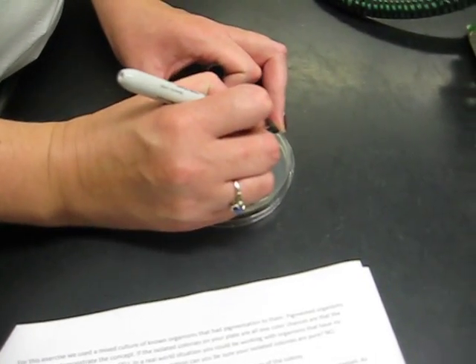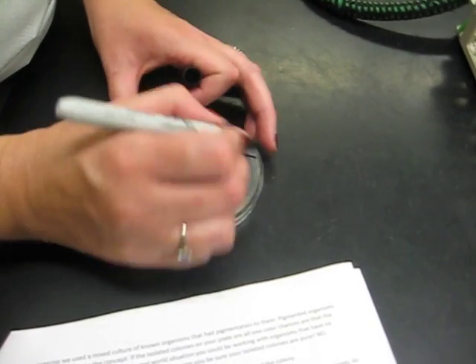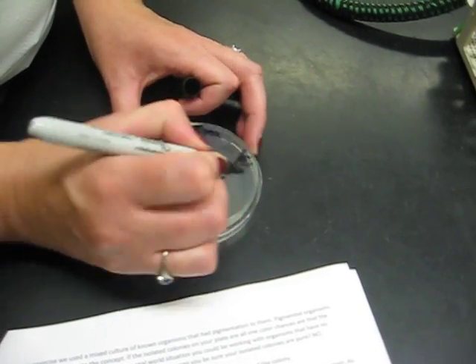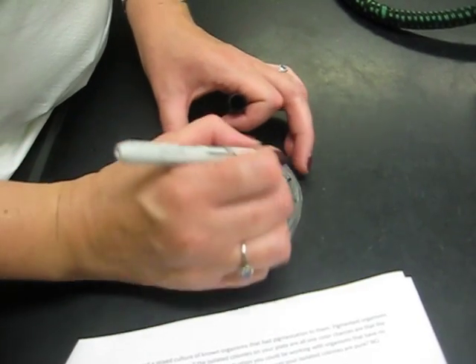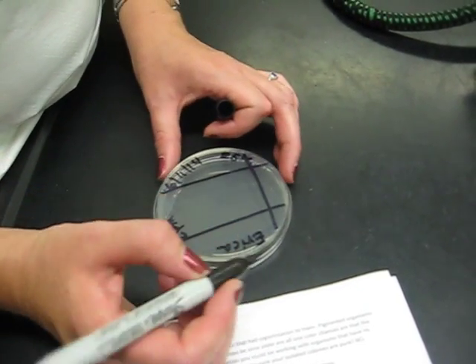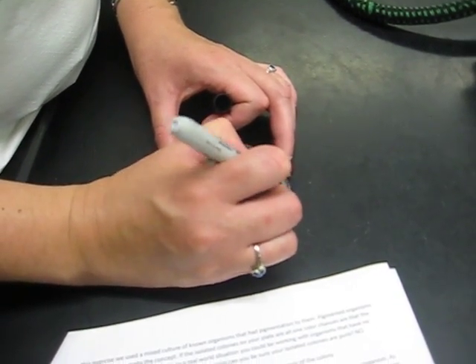Along the edge I'm going to write my name, the class time, the date, the temperature, which is going to be 25 degrees Celsius for this one. What am I forgetting? Oh, it's a mixed culture, so it's more than one bacteria in here.